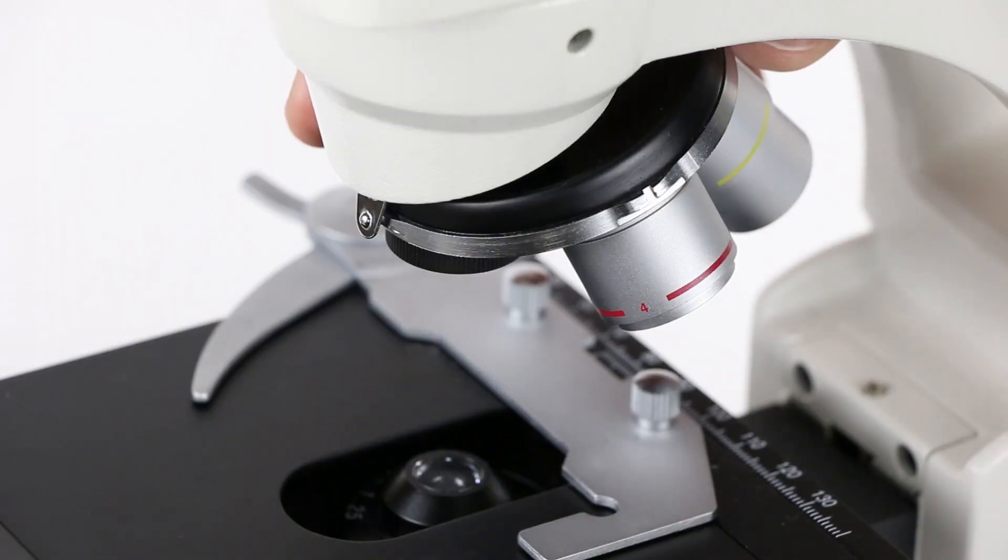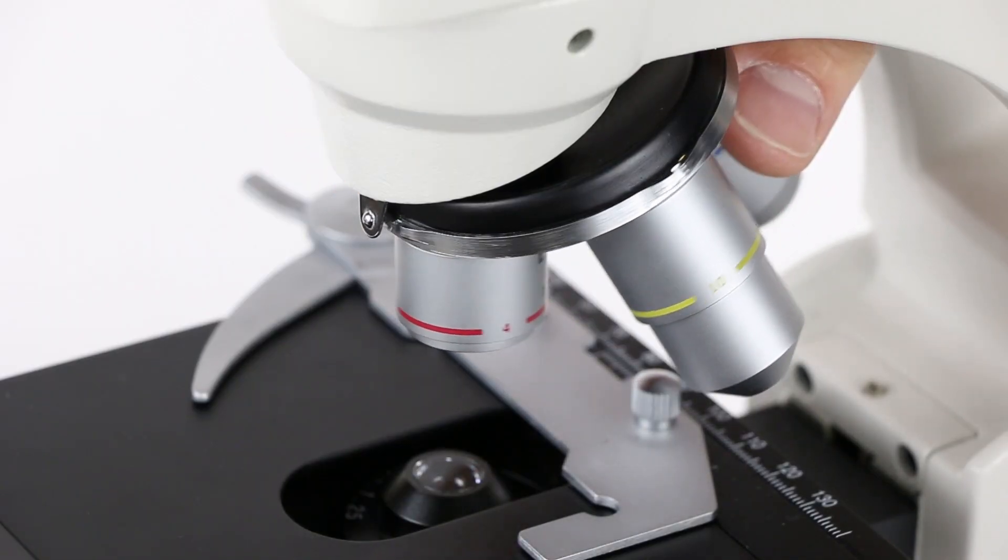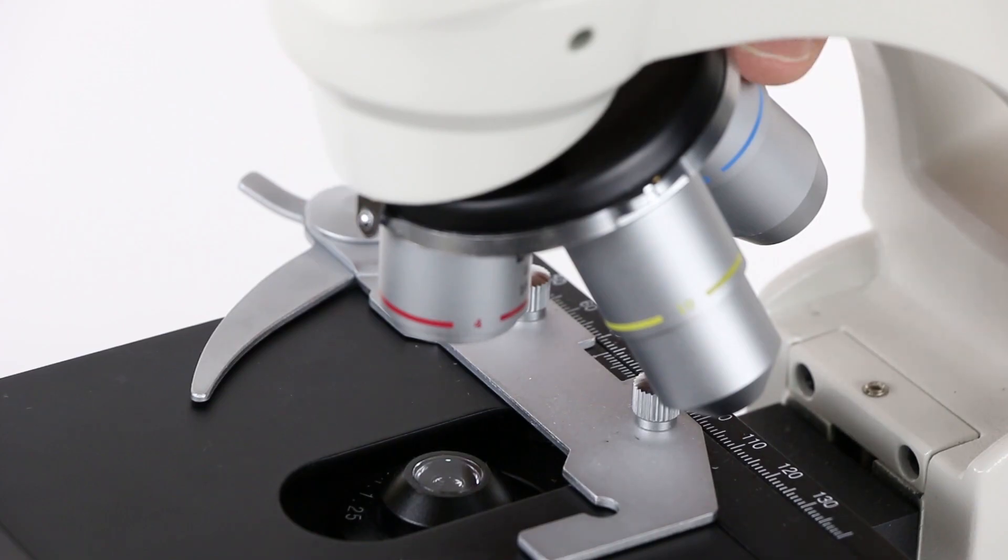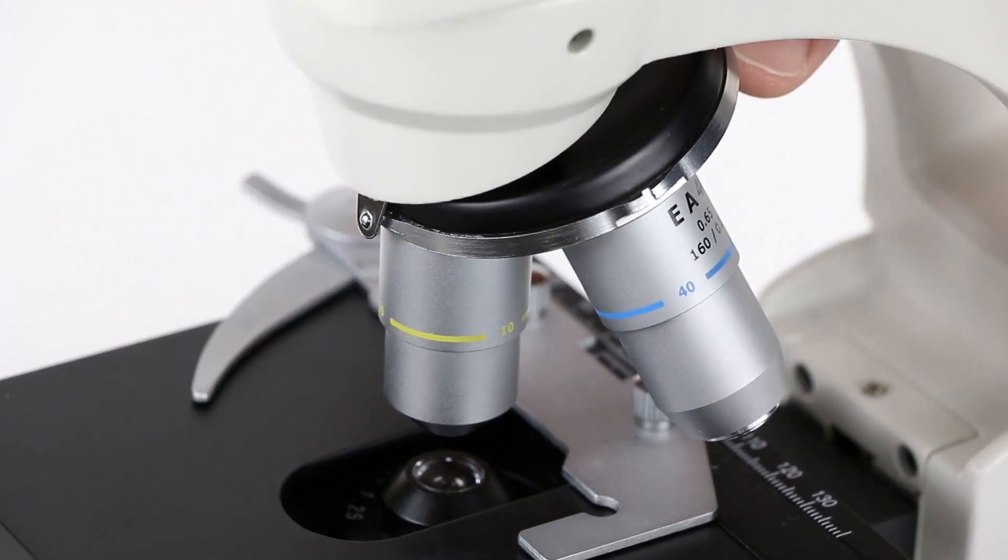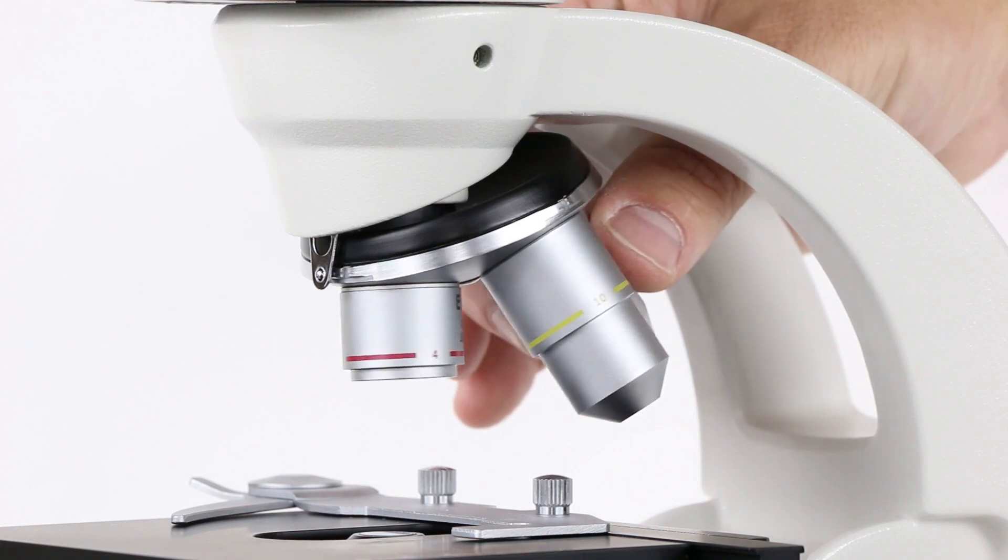Then, above the stage here, we have this revolving turret that's called the revolving nose piece. And as you can turn this, you can select different lenses. These lenses are known as objective lenses.